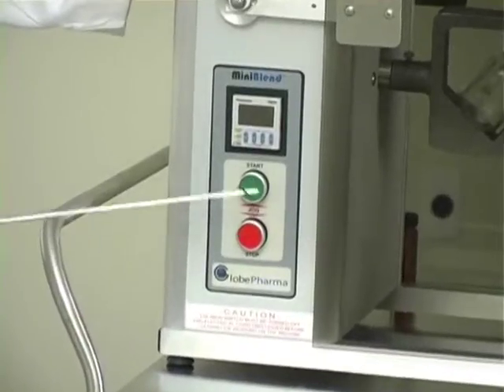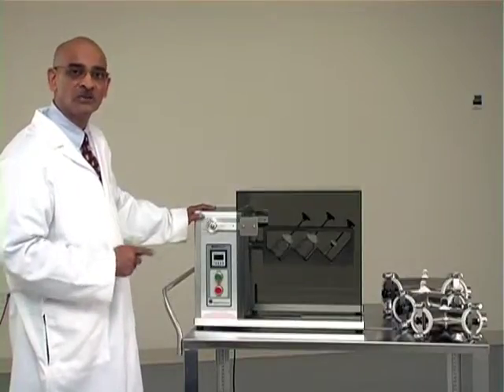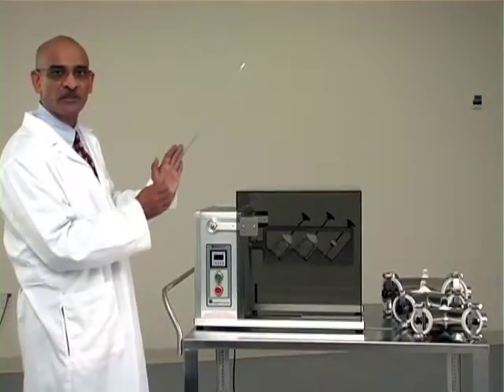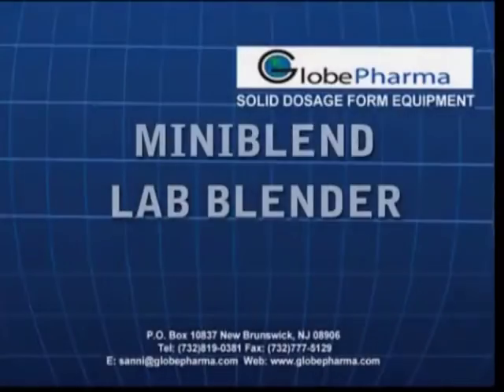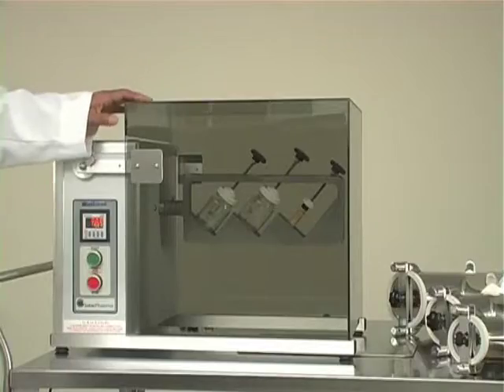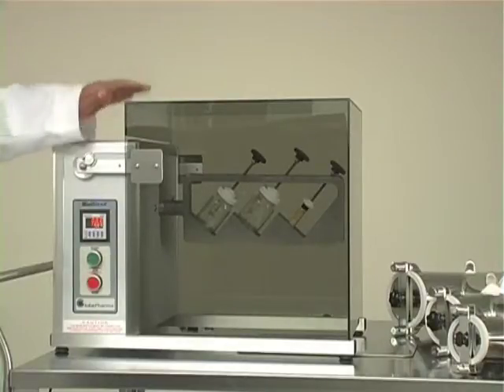It has a start button and a stop button. If you press both buttons together, you can jog the blender. If you have a V-shell and want to stop it in a particular position, you can press both buttons and it will jog to that position and then you can stop. Now I will show you how to use the bottle blending attachment followed by the V-shells to make small powder blends on the Mini Blend powder blender.